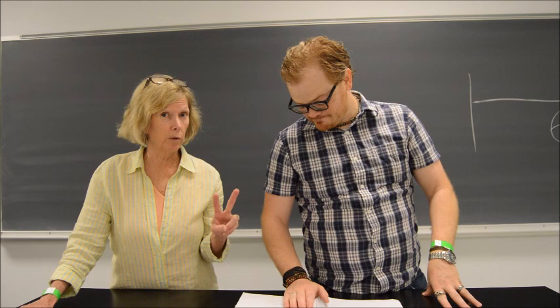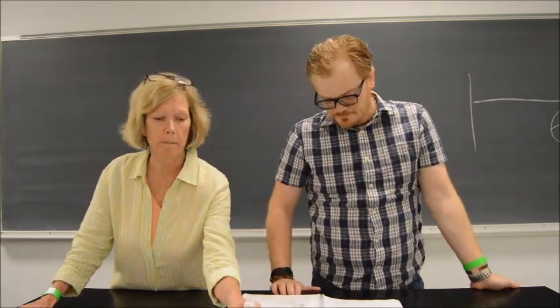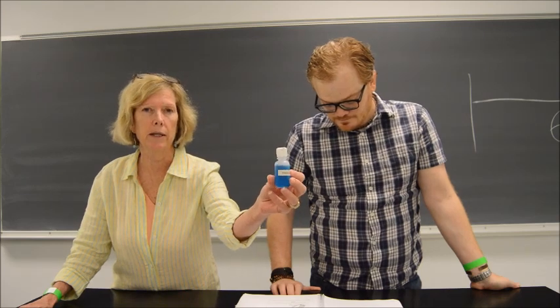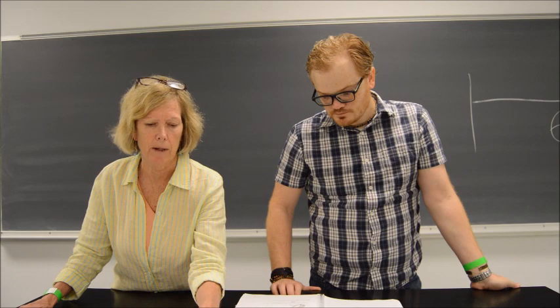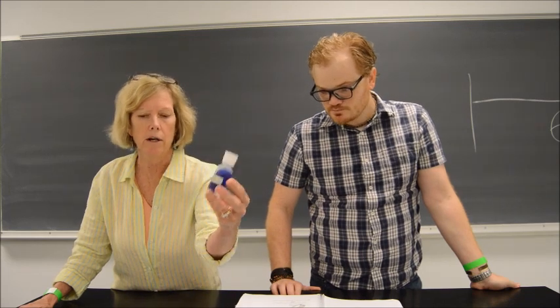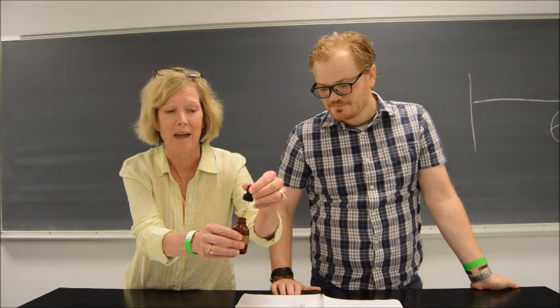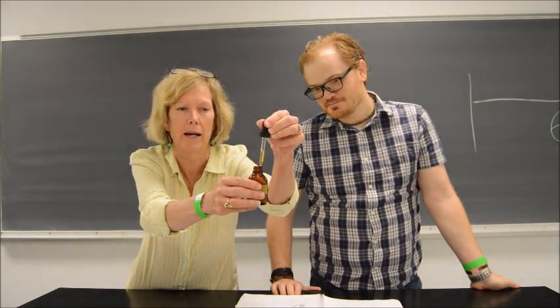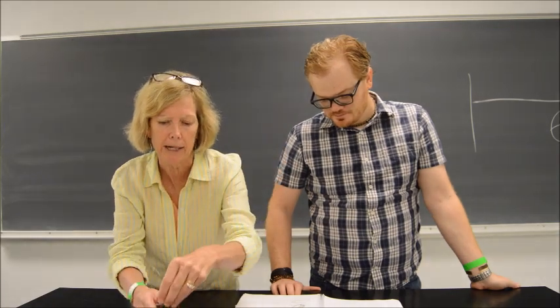So that means that we're doing two tests because the simple sugars are tested with a test called Benedict's, and here's the reagent. You can see the color of the reagent. But the complex polysaccharides, such as starch, are dealt with a different test with iodine. And I don't know if y'all can see, but iodine has a yellow-brown color. Okay, so we have two tests for carbohydrates.